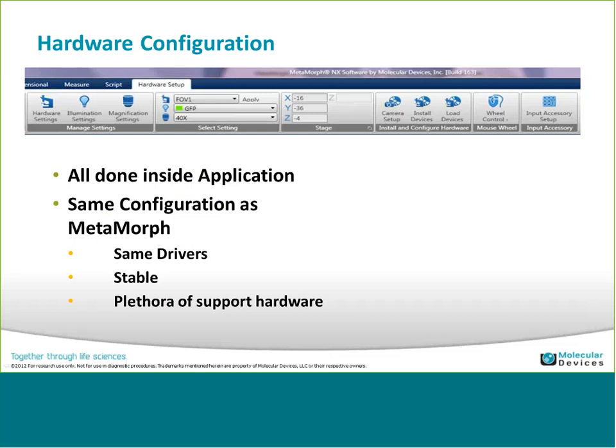To start acquiring, the first thing you do is go to the acquisition mode ribbon. So this is the acquisition mode, active context. As you select the options that we have available here on the acquisition mode, that's going to change the mode active context and the ribbon that's associated with that active context. So as we choose multidimensional, this will change to mode multidimensional.